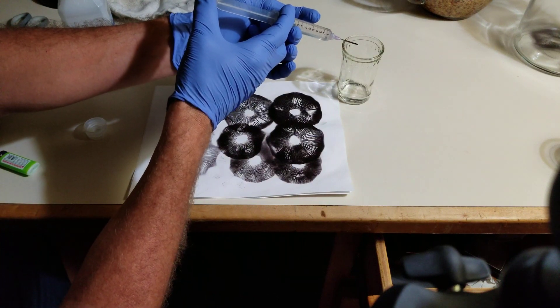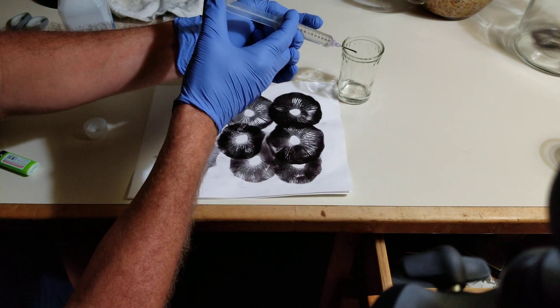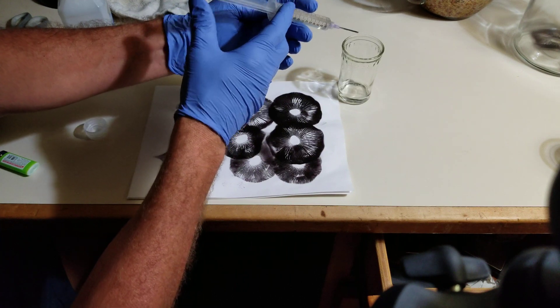A tad bit of water will cool it. You can't put a burning needle onto spore prints.